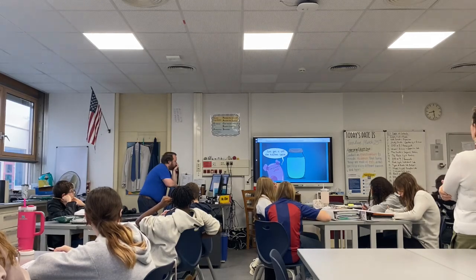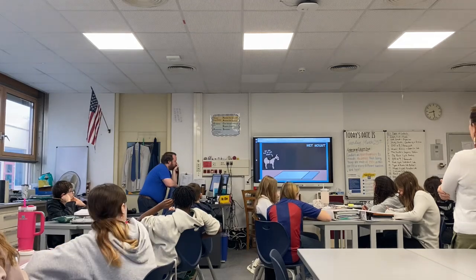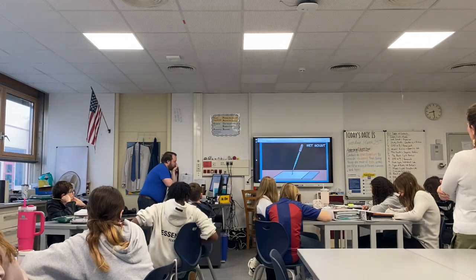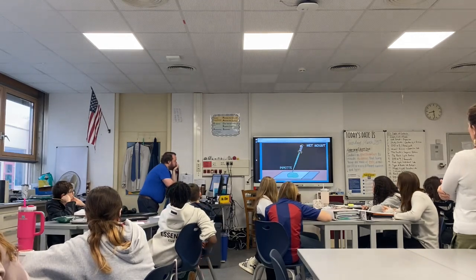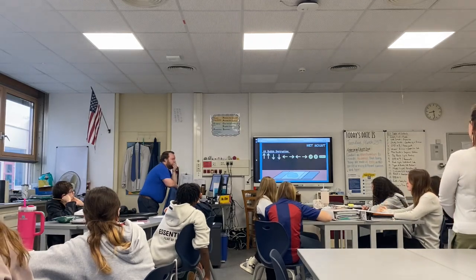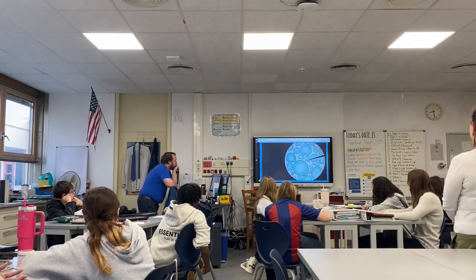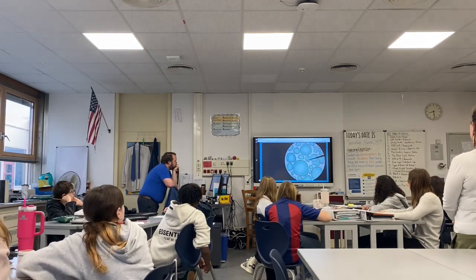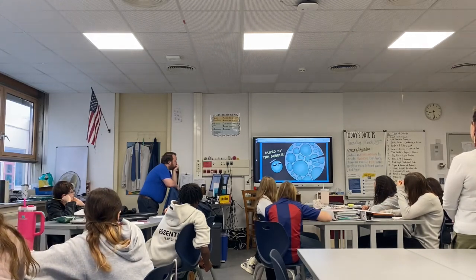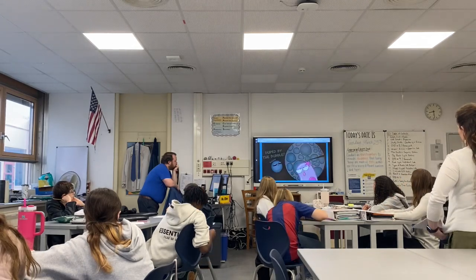So let's take a look at what's in this water sample here. I'm going to do something called a wet mount to prepare my microscope slide. I'm going to drop a drop or two of my water sample onto the slide using a disposable pipette. It's like a very fancy eyedropper, kind of. I'm going to put a cover slip on top. There are some techniques to doing a wet mount to avoid air bubbles that you can check out online. Air bubbles actually can look kind of beautiful under the microscope, which can lead to great disappointment when you find out they're not some amazing microscopic organism, but rather just an air bubble. Something I may or may not know by experience.